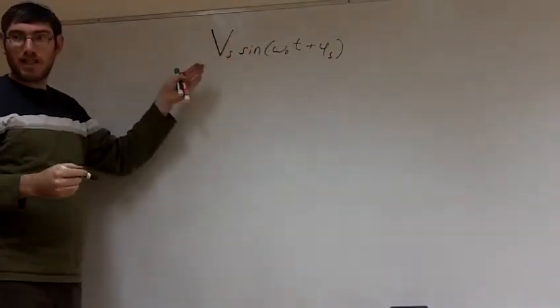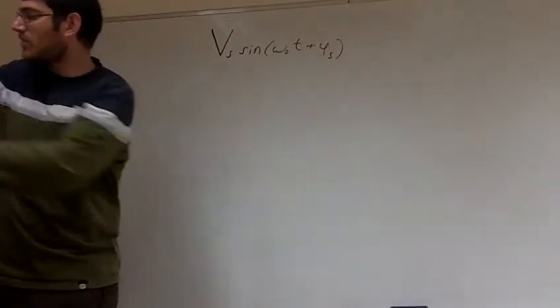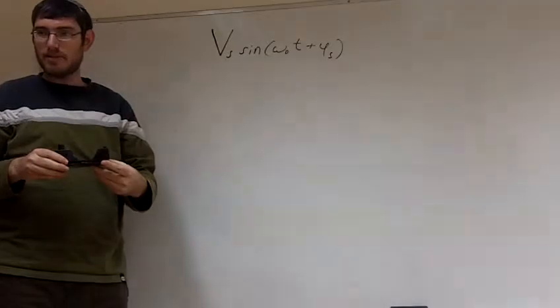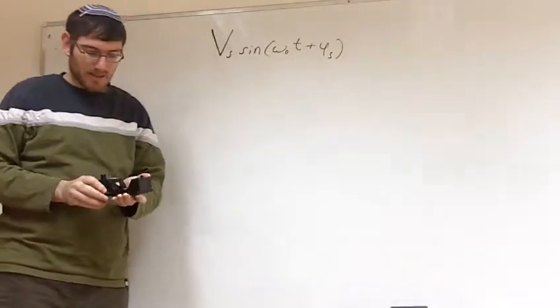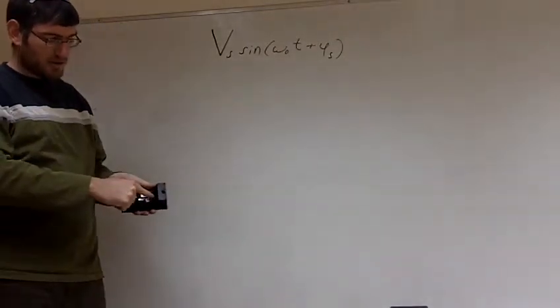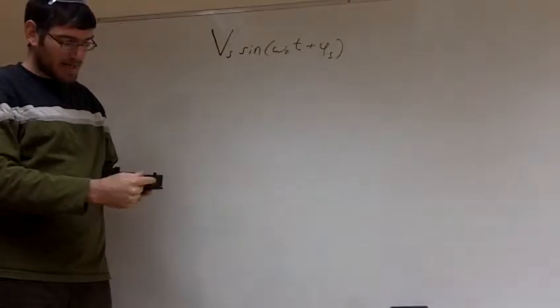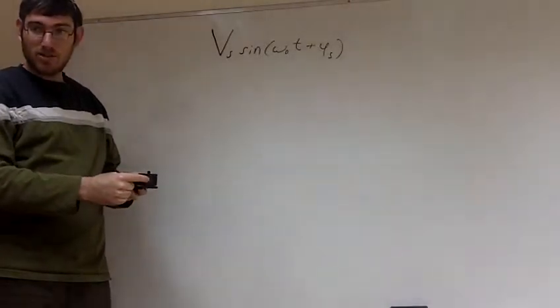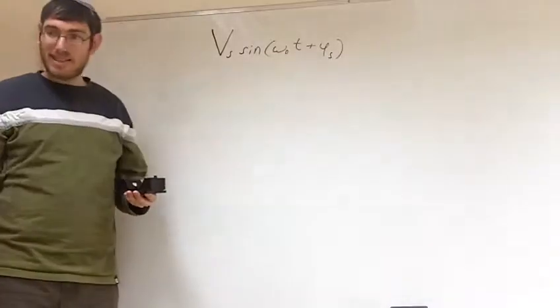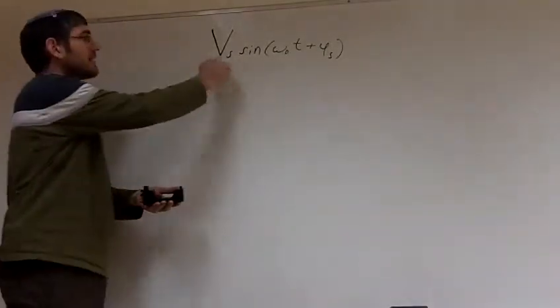There is a preamplification, first of all, inside the head. This is what we call the head, the MV1000. You saw it, Robert? The laser comes out from here, hits the tip, and goes onto the PSD right here. Inside here we have a preamplification, a first amplification, and then this signal is sent out into the lock-in. This signal, which is sent out into our lock-in, is what we're going to call the input signal.